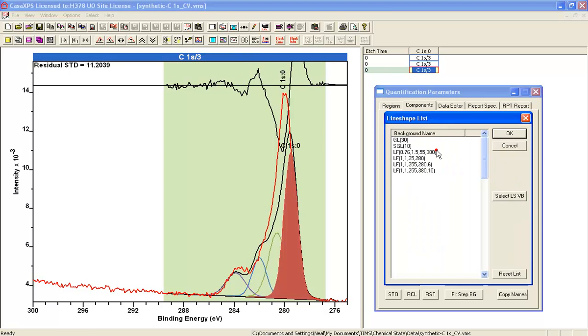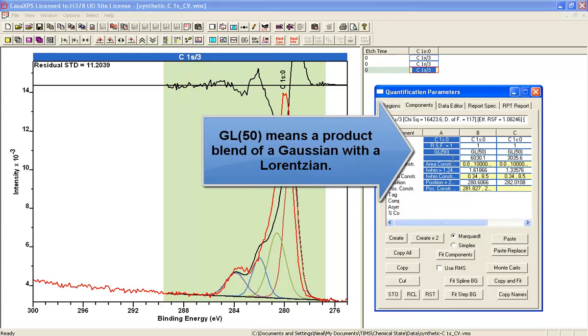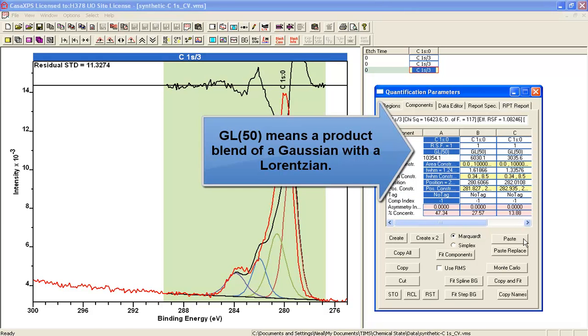It's not completely different, it's a blend of a Lorentzian and a Gaussian, which is what an LF line shape is. The LF line shape is actually a convolution of a Lorentzian and a Gaussian. This one is a mathematical functional form.